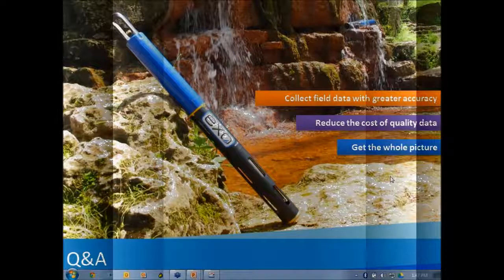A couple questions about data logging and wireless. So if you're just doing continuous monitoring, there's a few ways. You drop some batteries in the sonde and you set it up typically for a 15-minute logging interval. It'll wake up, take readings, and store it in its internal memory. And now memory is inexpensive. There's lots of memory on board. And then I'd say about half of our users actually take sondes and hook them up to data loggers so you can transmit that data wirelessly over the web.